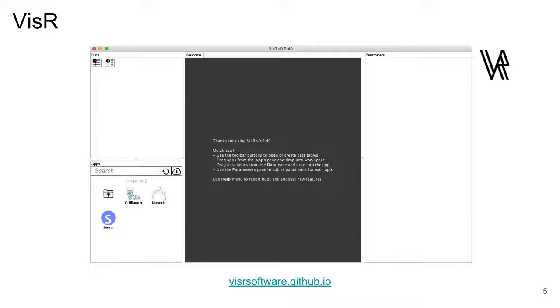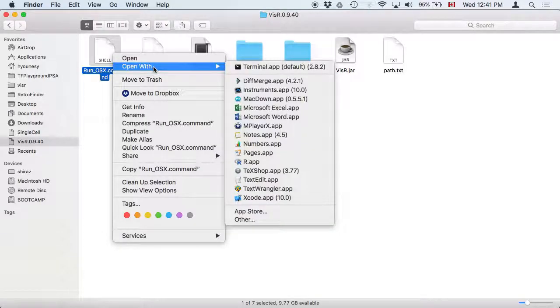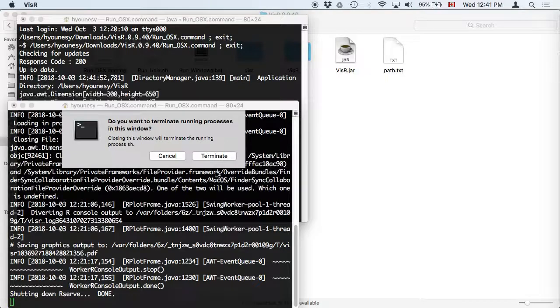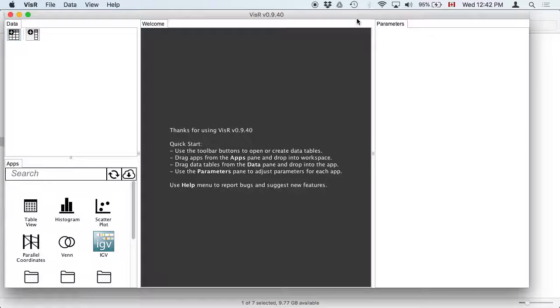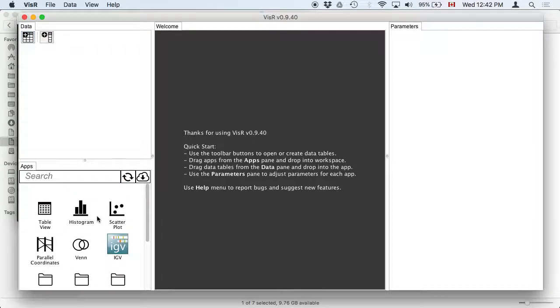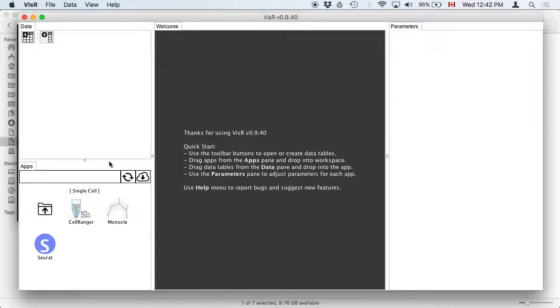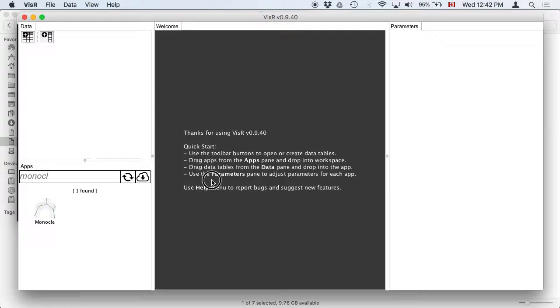VizR is a desktop application you can download from the link shown. Once you open it, it's a directory structure, and you choose the correct launcher based on your platform — here I'm using the OS X one. It starts up like this, and there are many other apps which I won't go through today, but there are tutorials available. Here we'll just focus on Monocle. You can either browse to find the app — in this case it's under Sequencing > Single Cell — or you can do a search. Then drag and drop the app to the workspace.